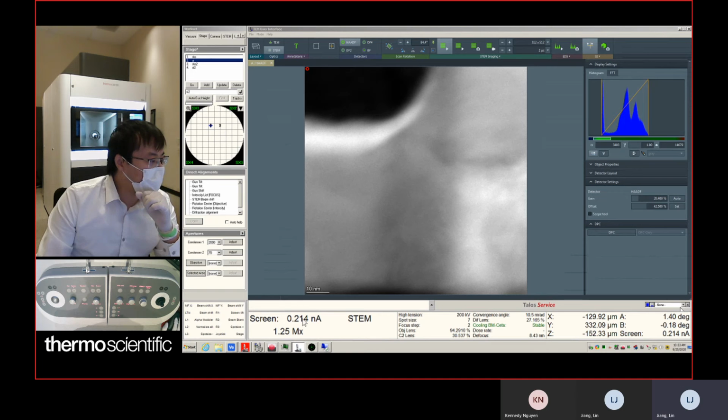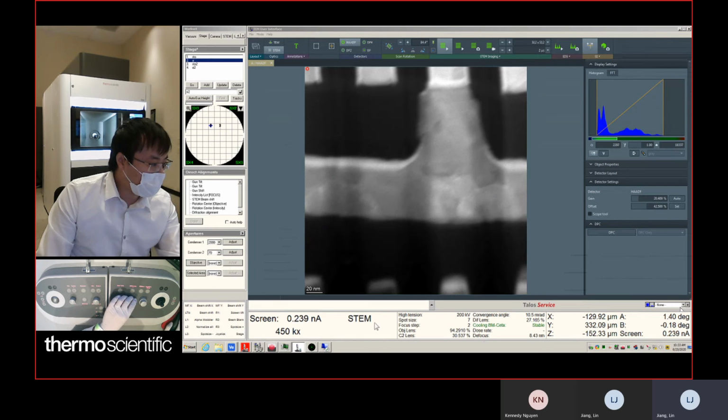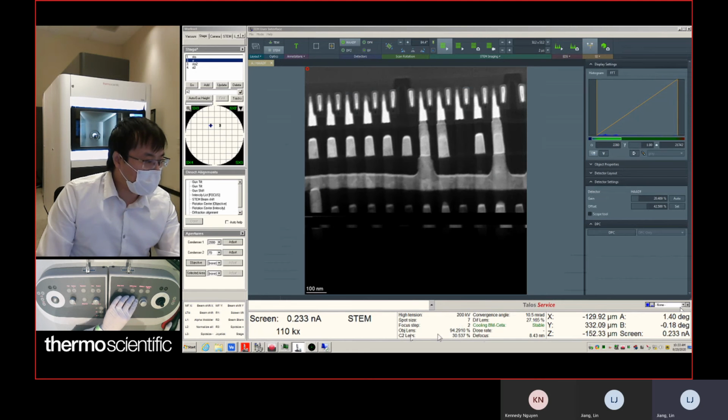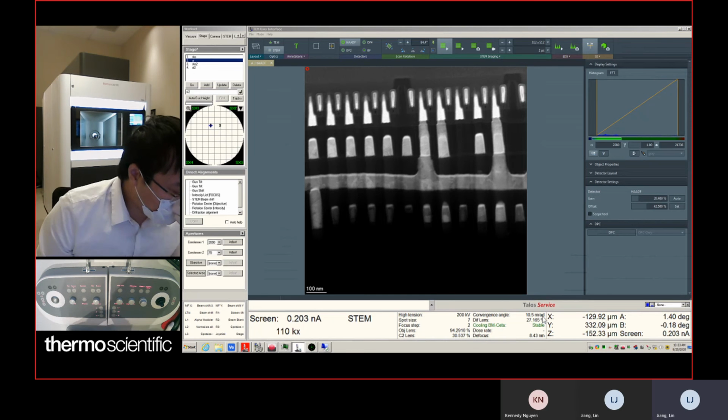And more. The bottom gives you a live view of your magnification and the beam current, the mode, and your high tension value, spot size number, focus step, objective lens value, and C2 lens value, and also your convergence angle. So 10.5 is the convergence angle we usually use.